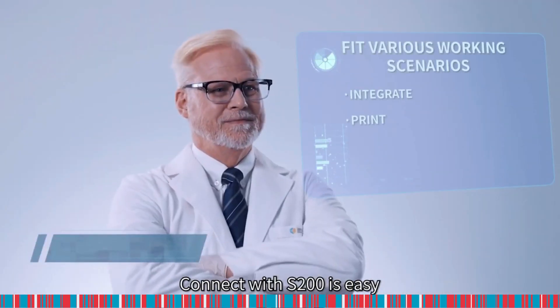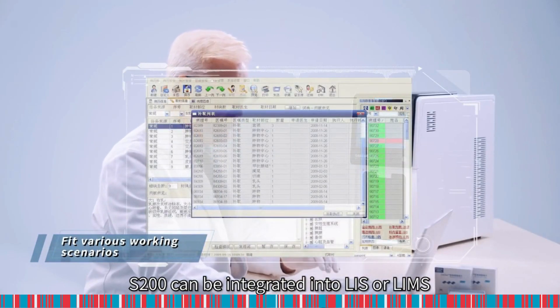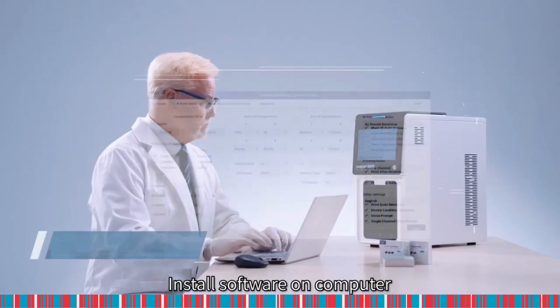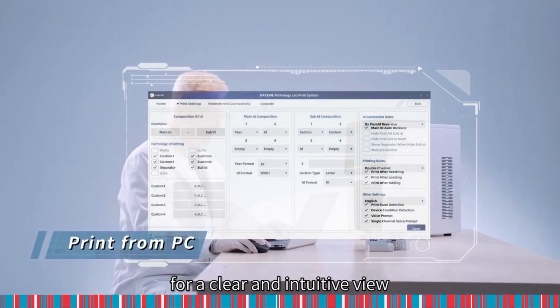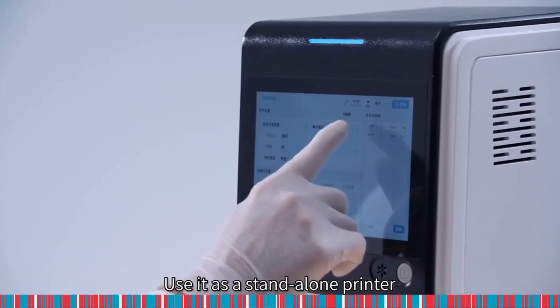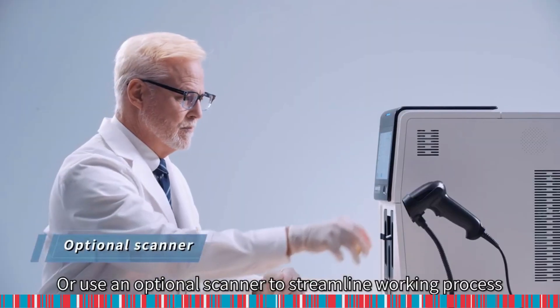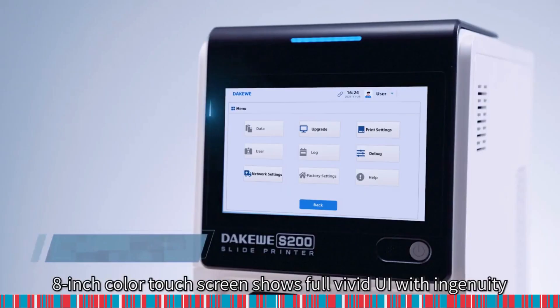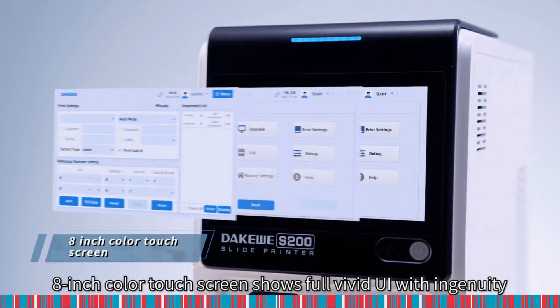Connecting with the S200 is easy. The S200 can be integrated into LIS or LIMS. Install software on a computer for a clear and intuitive view. Use it as a standalone printer utilizing the built-in printing system, or use an optional scanner to streamline the working process. An 8-inch colored touch screen shows a full vivid UI with ingenuity.